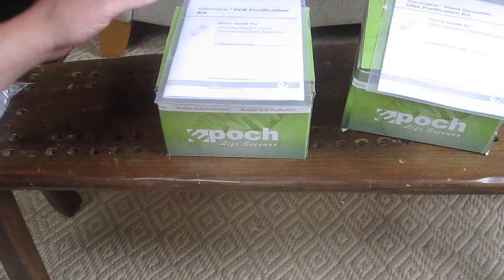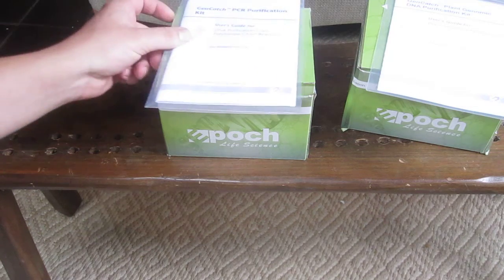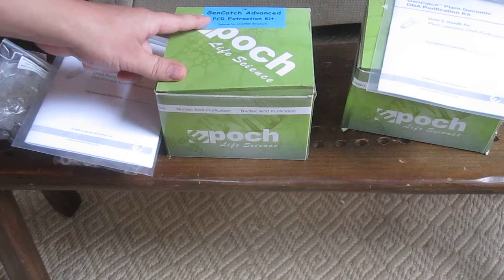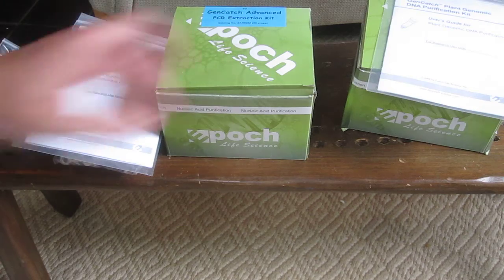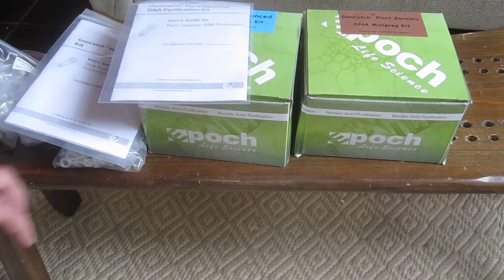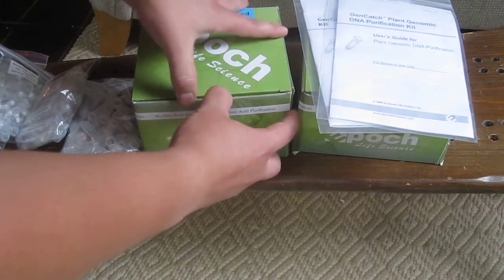What's nice about these, besides being a great company that sent us such great samples — which would probably be precedent to use them again after these kits run out — they also have some of the best prices. The PCR extraction kit on Epoch is only $38 for 50 reactions. If you look at Qiagen or some of the bigger companies, they'll charge anywhere from $70 to $80. On Qiagen, the plant genomic DNA kit is $200, and on Epoch it's only $100. So right there you're saving almost 50% and supporting a smaller company that sends pretty nice samples.